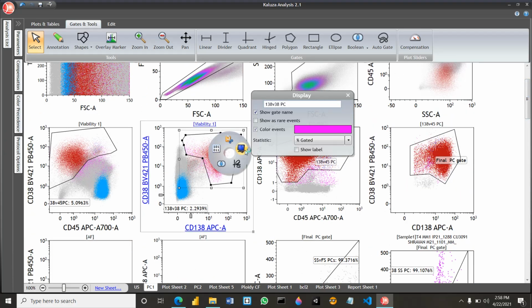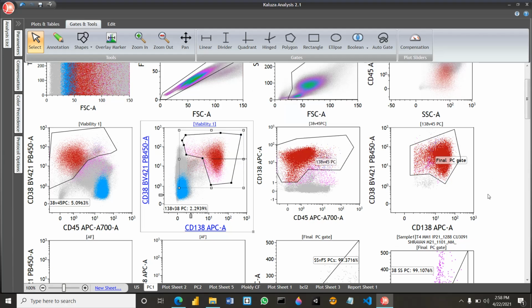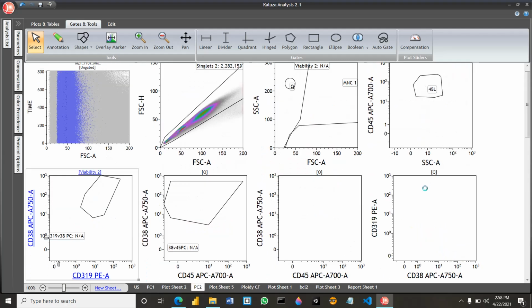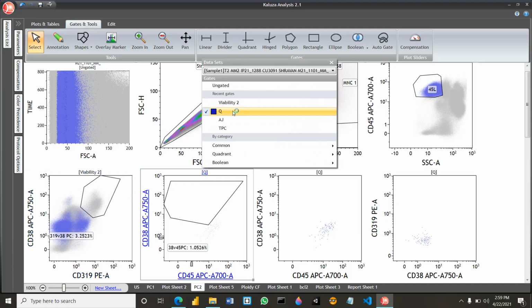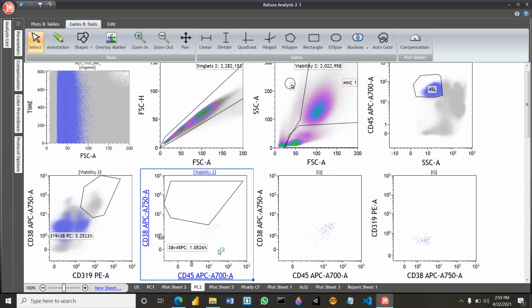This was a rough estimate, so let's see roughly what the percentage was, and it was 2.3, so this one is more. It looks quite right in both tubes, because this tube has no additional processing for cytoplasmic staining, so the number of plasma cells usually is higher. It may be different as compared to the other tube. So we have this population, and then we can choose this population and confirm with the other markers, or we can confirm with CD38 and CD45 again.